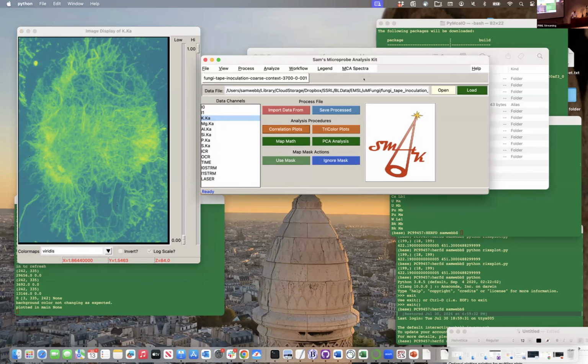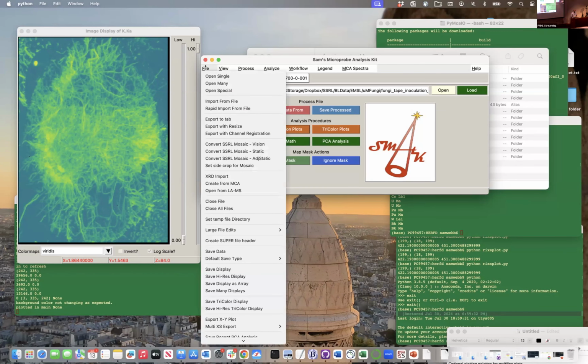So when we take our data at our beamline, we have a mode where we take a mosaic image and put it all together into a big mosaic, and it overlaps about 50% of each image, so you get lots of overlapping tiles. Most of your other vendor software will probably mosaic that for you and create some sort of JPEG, hopefully, which you could just import directly.